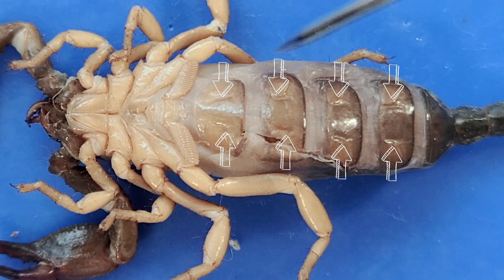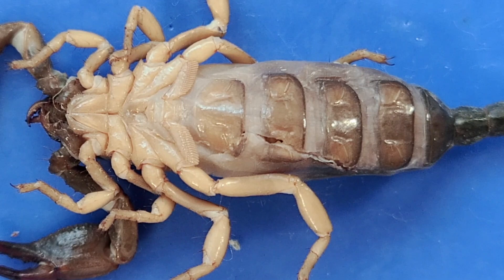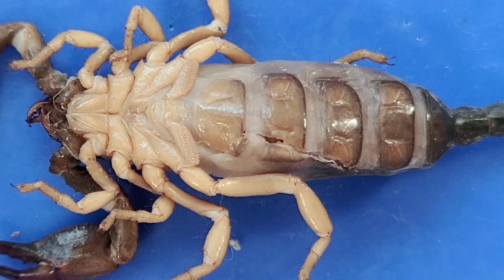Now along the abdomen, you might be able to see these tiny holes in each segment. These are called spiracles, and that's where air enters the scorpion's body for gas exchange. So scorpions don't breathe through their mouths — they breathe through these little holes. The scorpion, like many arachnids, actually has a type of lung called the book lung. Book lungs consist of a series of thin plates that look like the pages of a book, and these spiracles would open up into the book lungs.